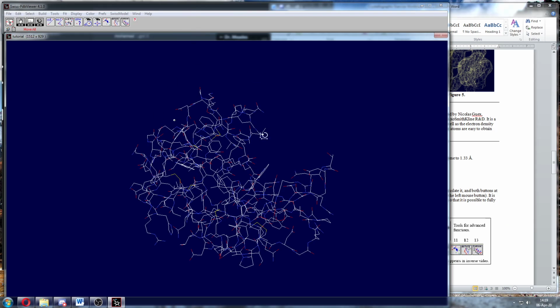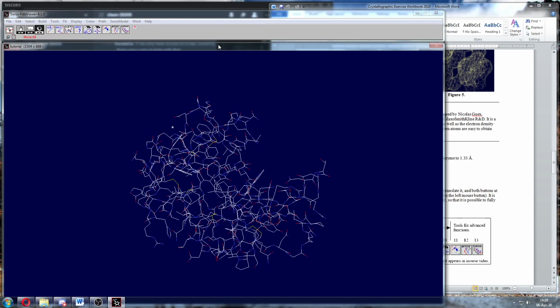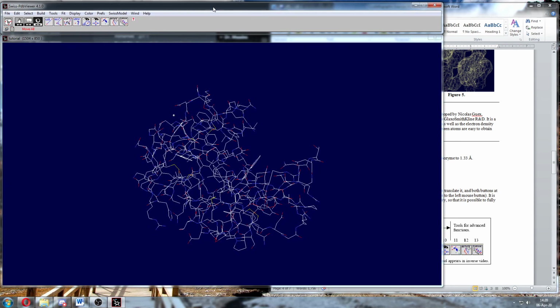This is the only thing I need open. Right? And I'm going to set it to a size that just fits on my screen.